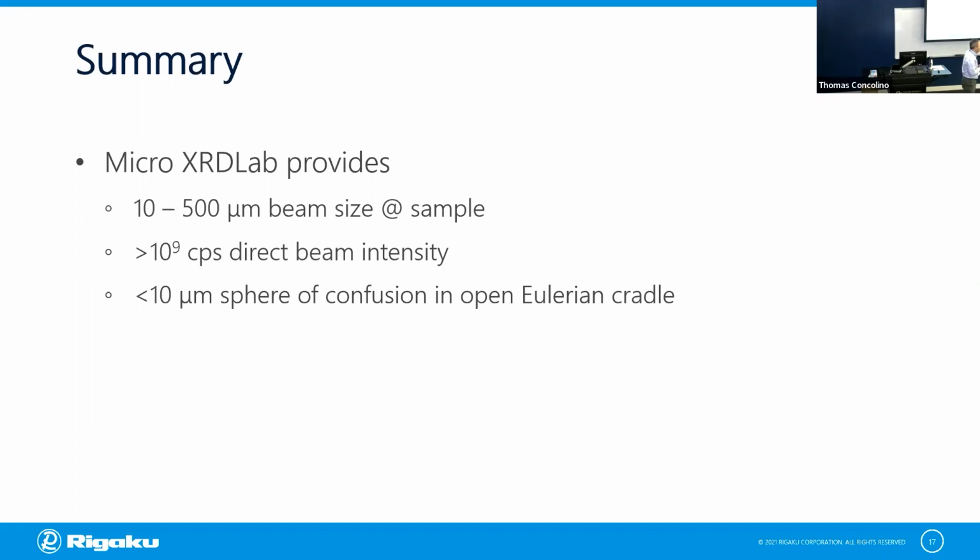A liquid metal source has a very high radiance, meaning the focus spot could be smaller than 70 micrometers. This system has a 70 micrometer spot, and liquid metal could have 50 micrometers, but the power loaded to this area is much smaller. So power density wise, this may provide higher power density. But if you need high brilliance, I would say the liquid metal jet may provide better brilliance.